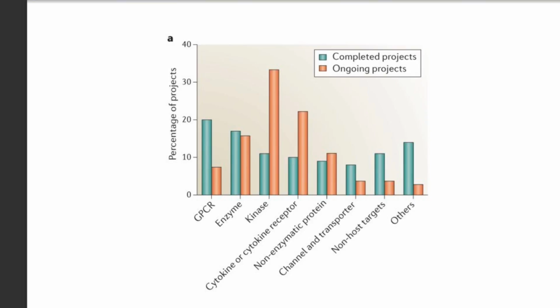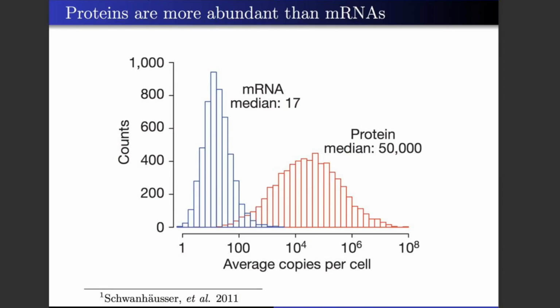So why is it hard? Now, for at least 5 years, sequencing the transcriptomes of single cells has been growing and approaching becoming a standard method used across almost every major university, every major company. Proteins should be easier to quantify in some ways.